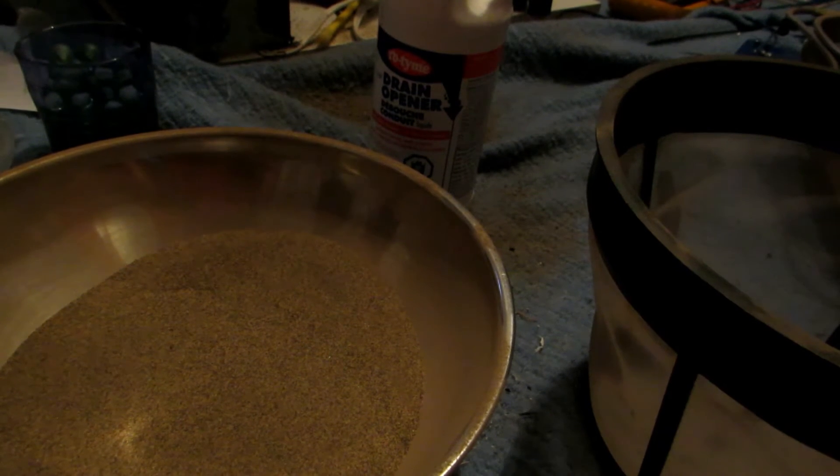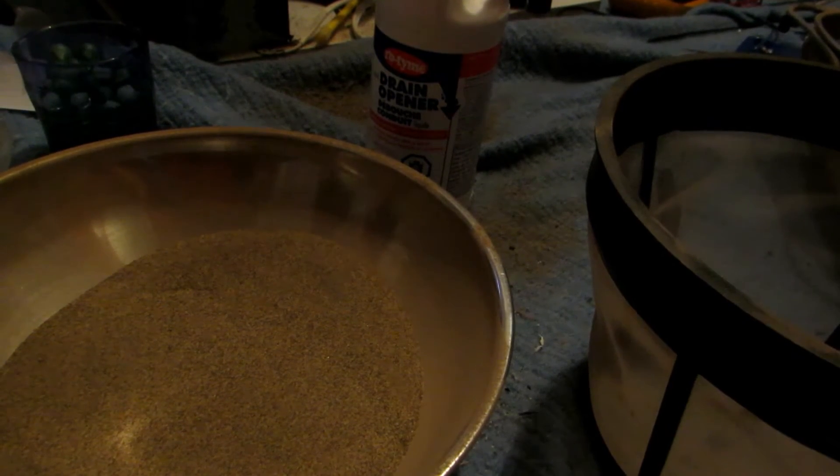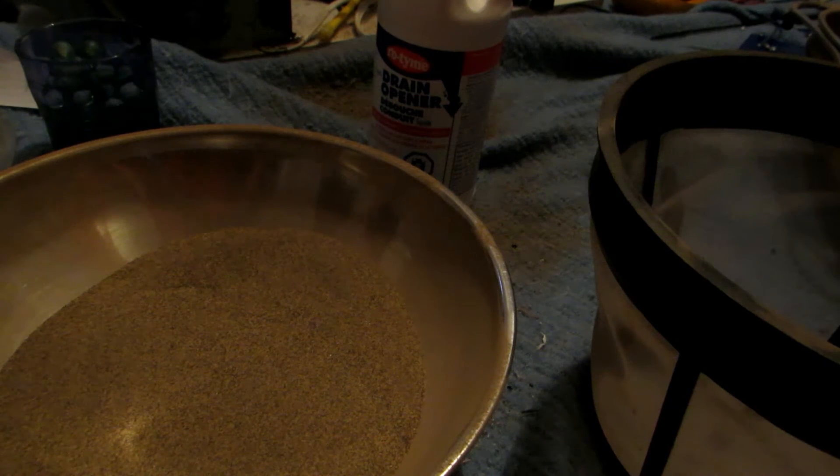Hey guys, welcome back to another video. Today we're going to be concentrating this sulfuric acid drain cleaner and cleaning it up so that it's about 98%, and we're going to be doing this by distillation.